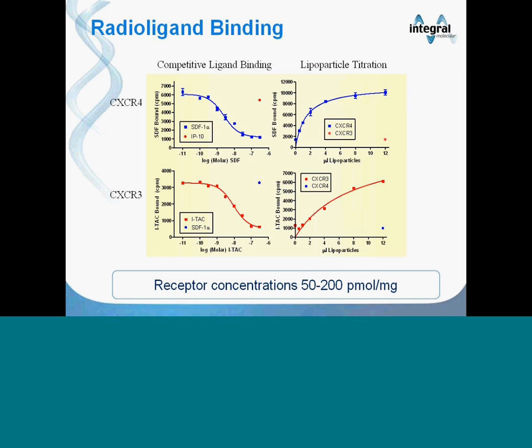We co-transfect the DNA for the virion core and the membrane protein of interest, so that the membrane protein of interest is overexpressed on the surface of the cell. Then the core assembles and buds through the cellular membrane, pinching off a piece of that membrane that contains the protein of interest. The particles are released into the culture supernatant, and that's where they're purified from.